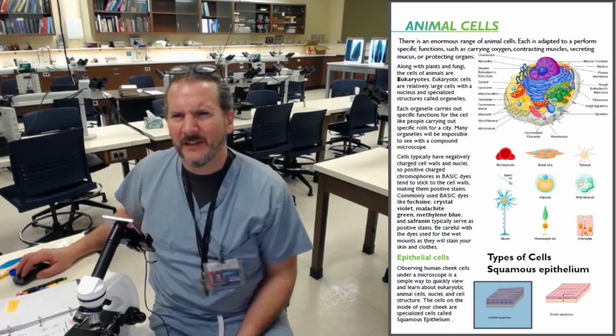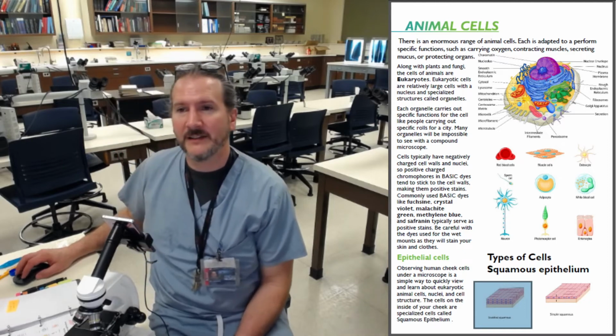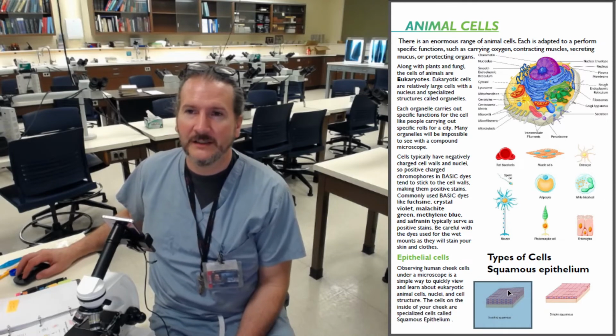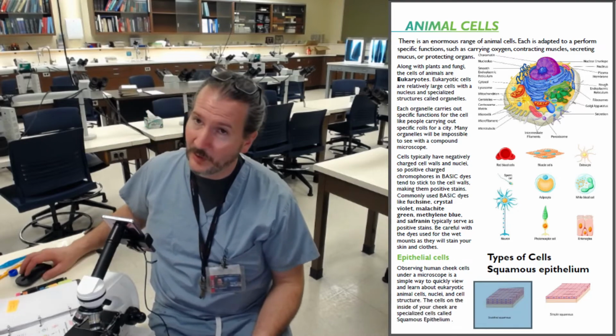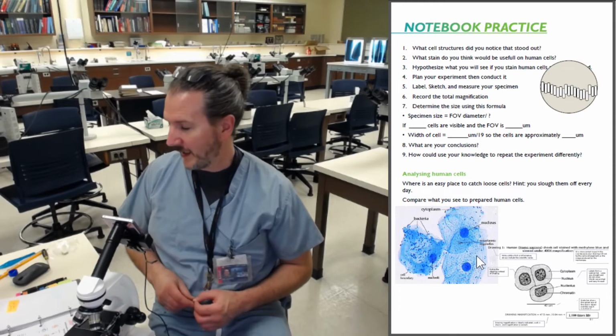Right? So if I have something like this and I look at the shape, they're little flattened cells, so they're squashed. I would call it a simple squashed or squamous cell. Here I have multiple layers, they're all squashed. Actually, the surface layer is squashed, so I would call that compound squamous. All right, we're going to go to the next page and pull some right out of you.